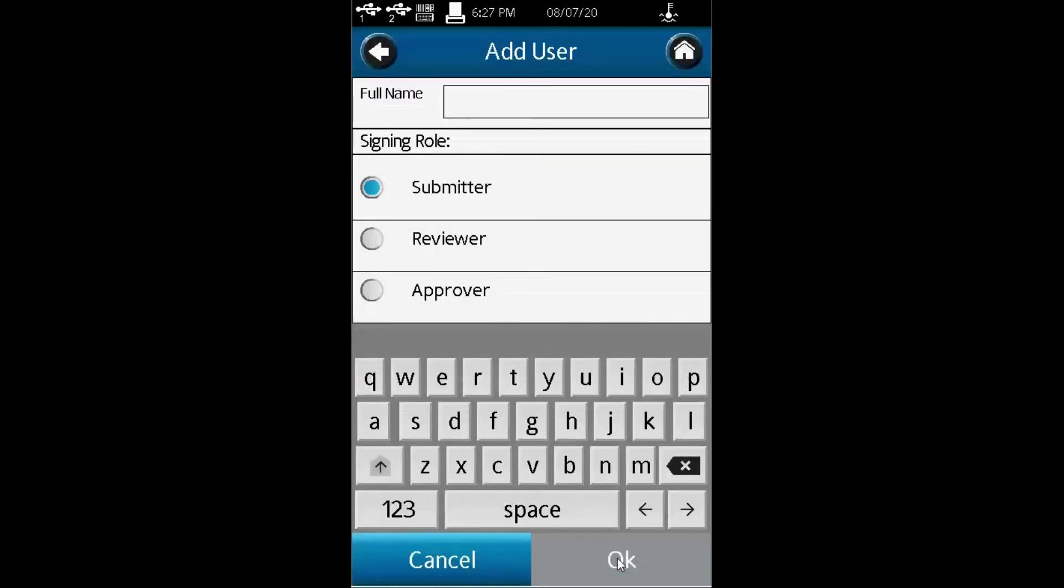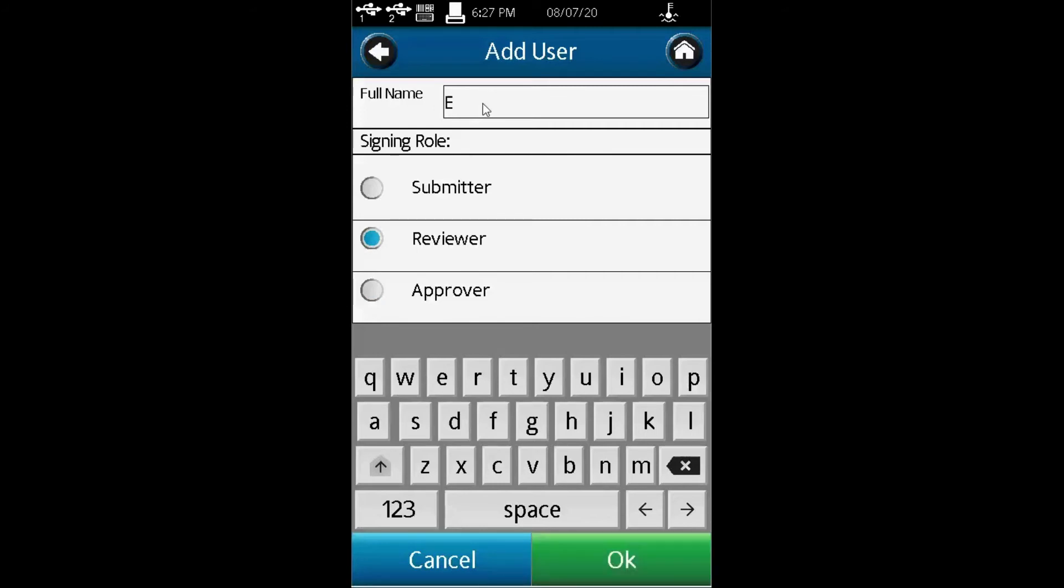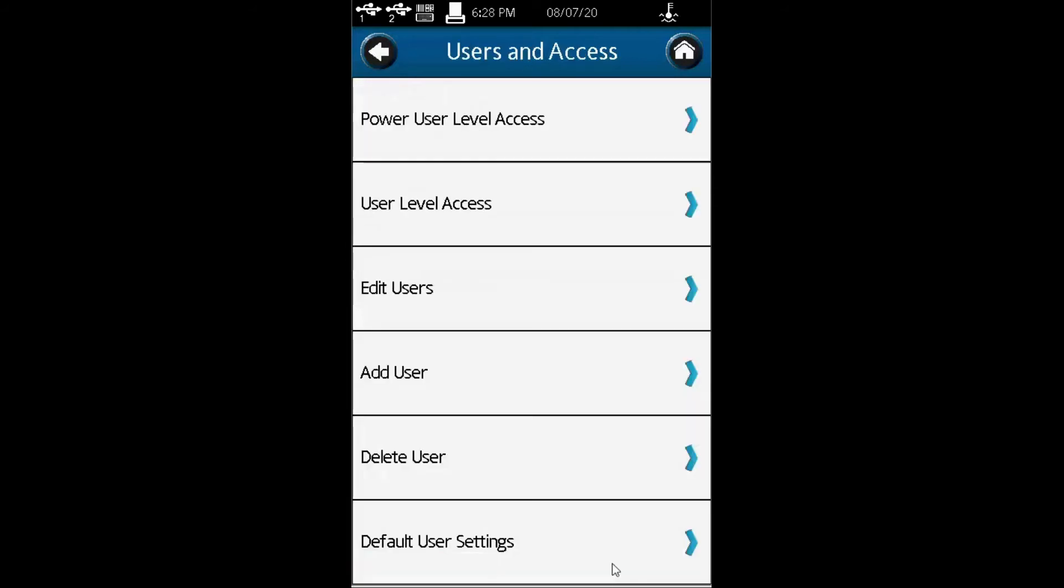In terms of assigning roles, I can make them a submitter, reviewer, or approver. Let's say he's a reviewer. When I sign, it's called Eric C. That is my signature, and I say okay. I'm good.